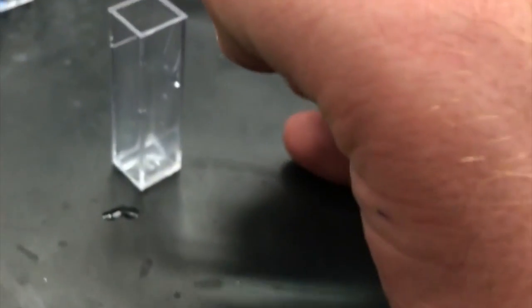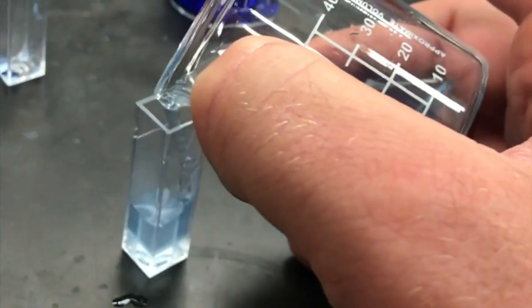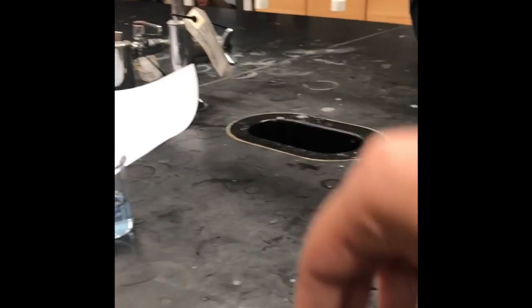Welcome to the Spectrophotometer lab. Today we will be using a spectrophotometer to determine the relationship between concentration and absorbance. Before that, we had to prepare our dilutions and fill our cuvettes with our solutions.